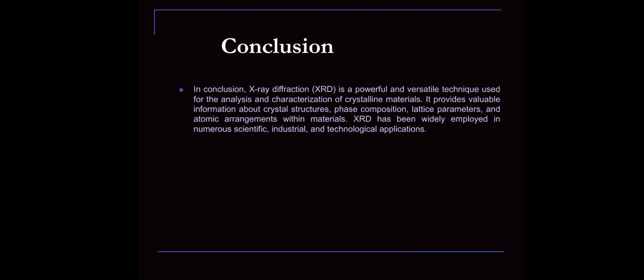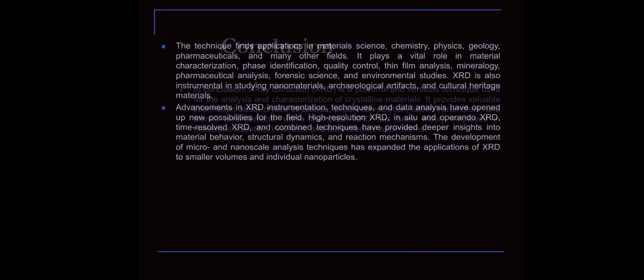In conclusion, X-ray diffraction is a powerful and versatile technique used for the analysis and characterization of crystalline materials. It provides valuable information about the crystal structure, phase composition, lattice parameters, and atomic arrangements within the materials. XRD has been widely employed in numerous scientific, industrial, and technological applications. The technique finds application in material science, chemistry, physics, biology, geology, pharmaceuticals, and many other fields. It plays a vital role in material characterization, phase identification, etc.